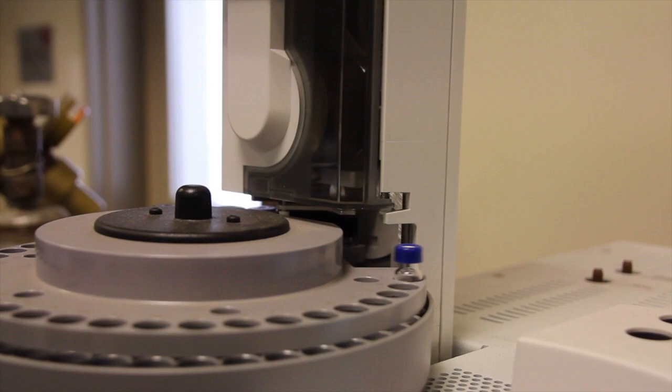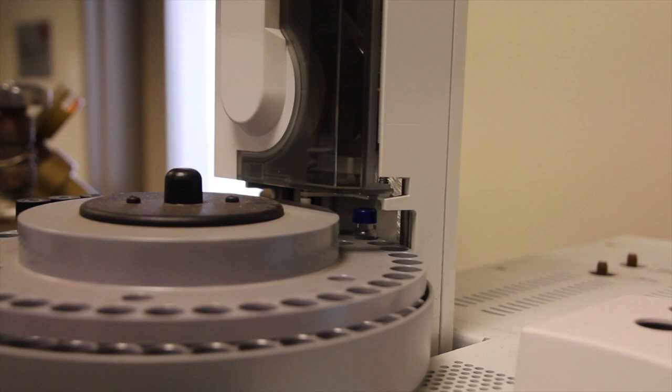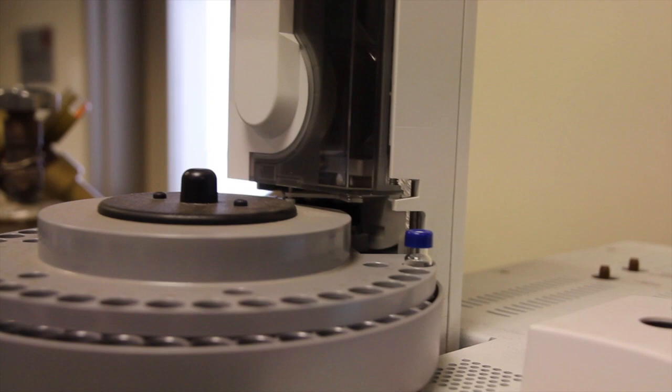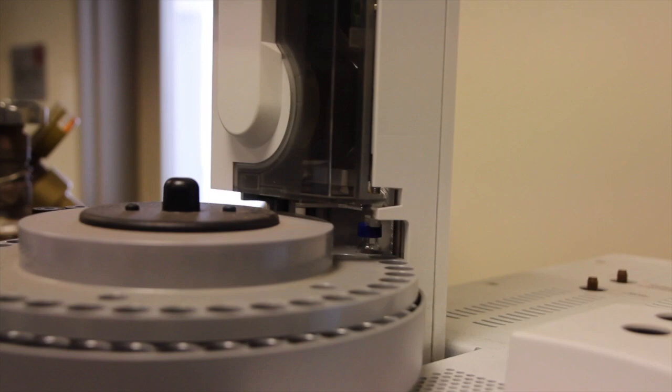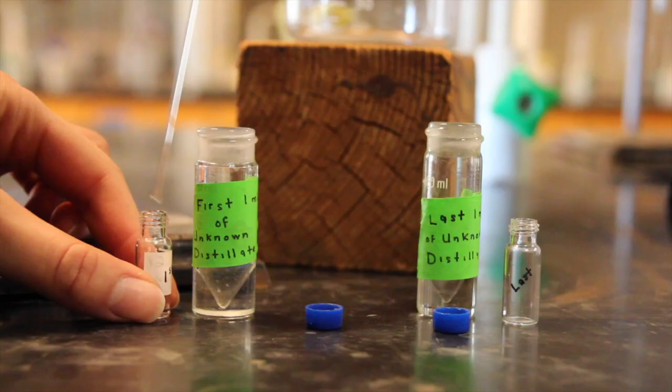In the second part of the experiment, your group will use gas chromatography to further identify the unknowns in the mixture. Gas chromatography involves running a chromatogram on each sample. Typically, a chemist would run a chromatogram on an authentic sample for comparison purposes. Fortunately, your professor has already run the authentic samples and since each compound has a characteristic retention time at certain temperatures in a particular gas chromatography column, we can use these as a reference.